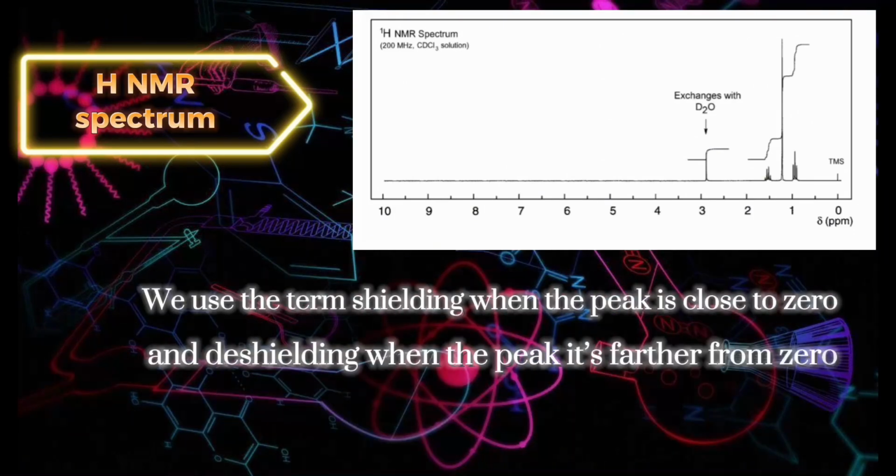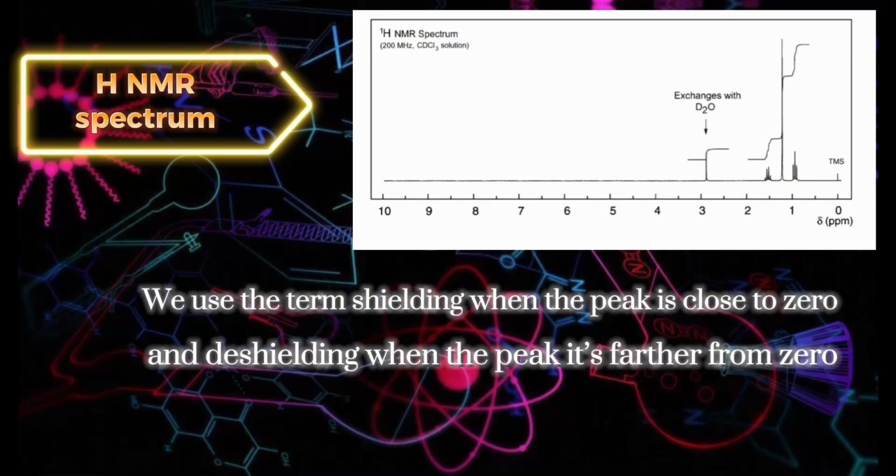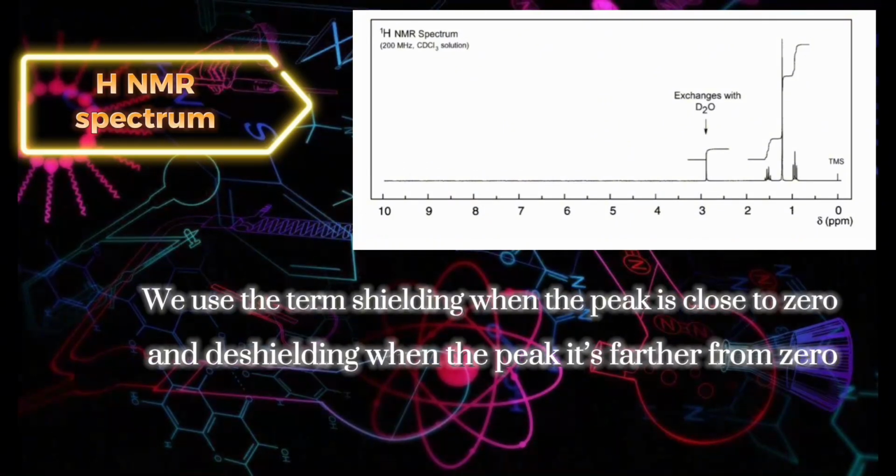If the group is far from the tetramethylsilane standard, it will be deshielded, and this is evidence that the group is linked to an electron-withdrawing group, and it will be shielded if it is farther from the withdrawing group. The quartet peak is far from the tetramethylsilane standard, indicating it is closer to the withdrawing group, followed by the singlet and then the triplet peak.